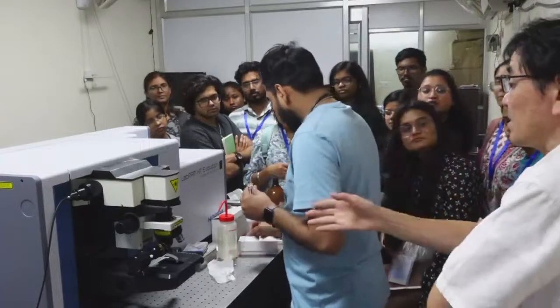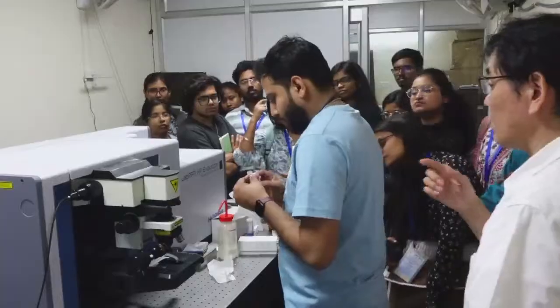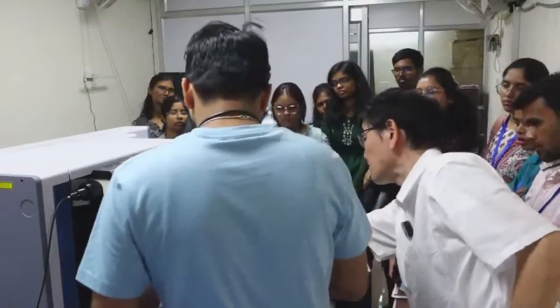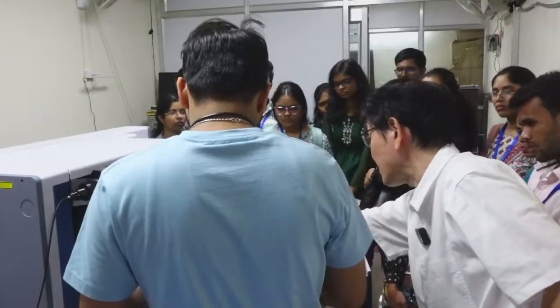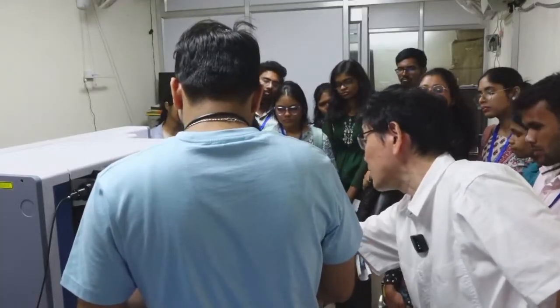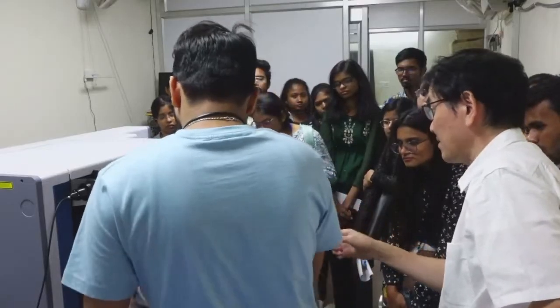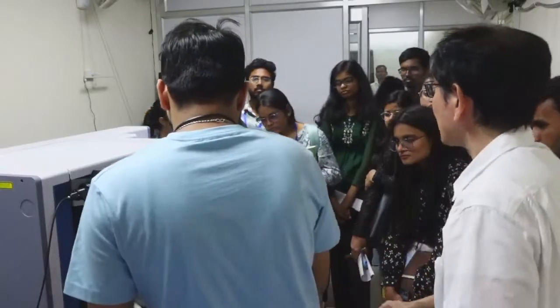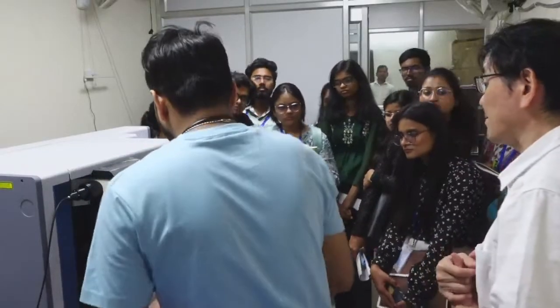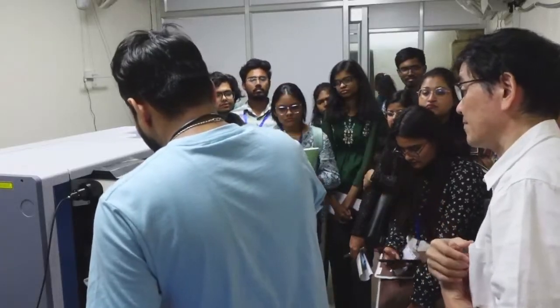So now the new attachment is put here. Instead of the microscope objective, it focuses and transfers the light onto this cuvette. So this is a typical Raman measurement, not a Raman microscope. And we can put the sample here.